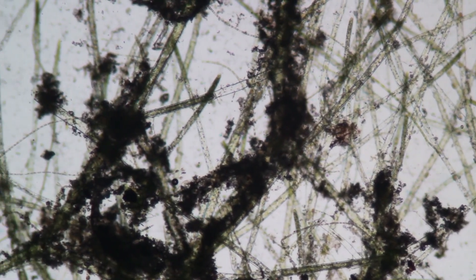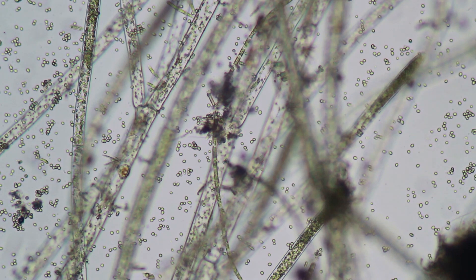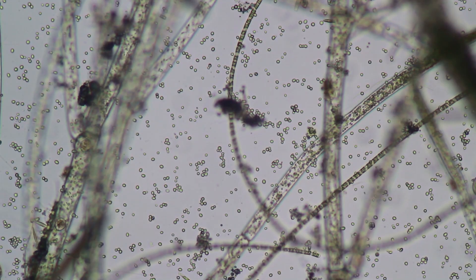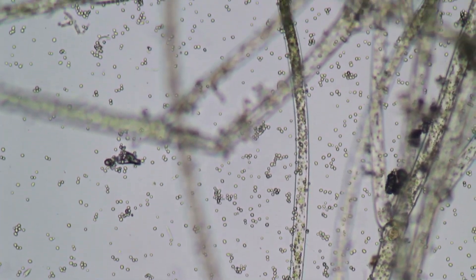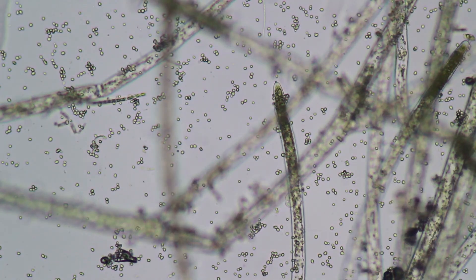I do see a lot of these algae — the black dark areas are some other things not quite well visible. At a higher magnification I start to see little egg-shaped dots and I have to admit I have no idea what they are. I think they're way too large for bacteria. But the string-like long algae can be seen quite well. Not so many organisms floating around — there is one now going in a circle pretty much in the middle.